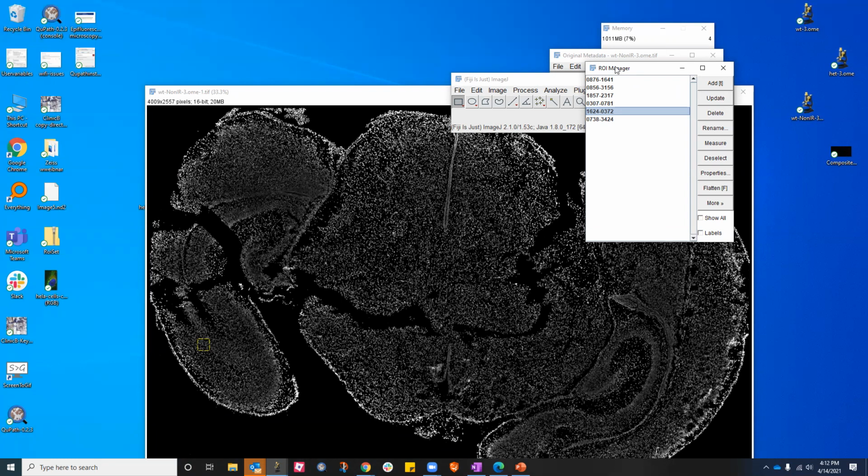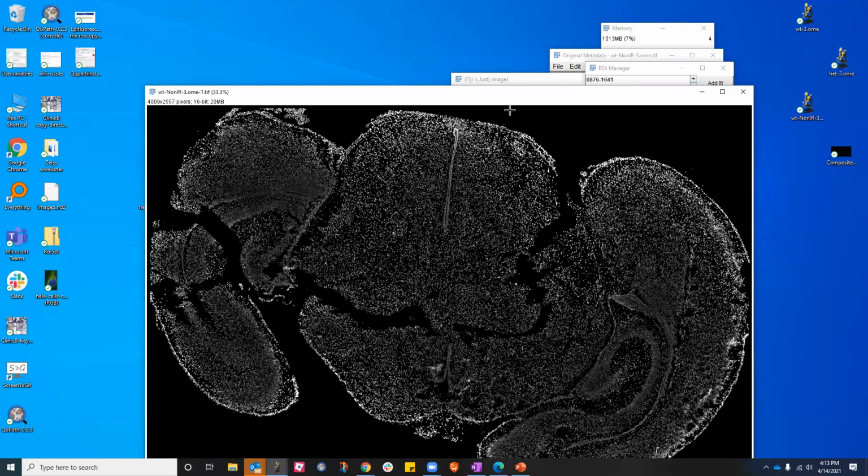Let's say if you are doing sectioning of spleen or a tissue that you get from an animal, right? And you just go and do a tile and stitch image. And of course, you're not going to put the entire tile and stitch. You will select a small area, right? But how do you remember I'm selecting the same area, right? And this is how it's very helpful.